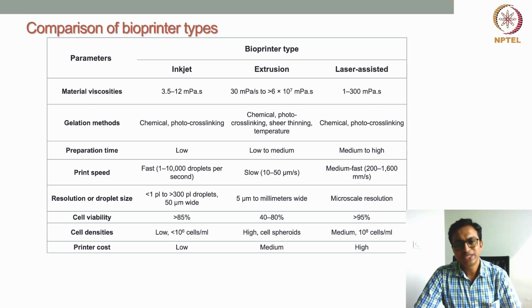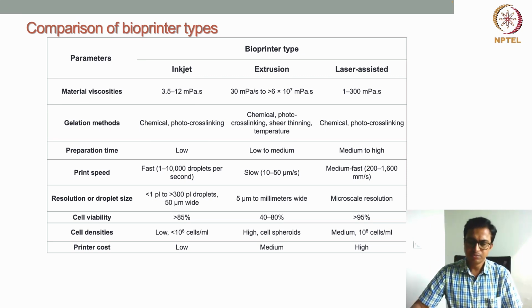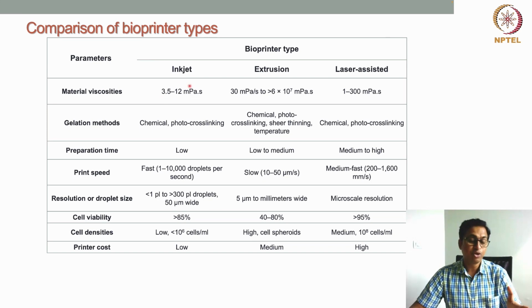generation using either a thermal or piezo based mechanism, right? So there we mostly use very low viscous material, and I have also mentioned that we use water-like viscous material. So the viscosity in case of inkjet printing is very low, and please remember this viscosity is almost like water or buffer. That kind of material we mostly use. That's why, as I have pointed out, there is a challenge of printing three-dimensional structures with these low viscous materials. So in case of inkjet, the viscosity is low.